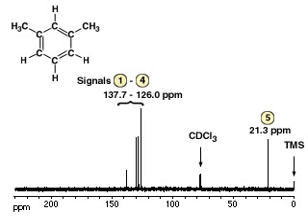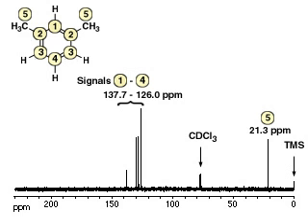This is the carbon-13 spectrum of m-xylene. Signals 1 through 4 belong to the aromatic carbons. The smallest signal is caused by the carbons labeled 2, which do not have attached hydrogens and receive little NOE enhancement. Without a correlation table, precise peak assignment for the remaining 3 peaks is difficult, and thus not required here. Signal 5 comes from the methyl carbons.